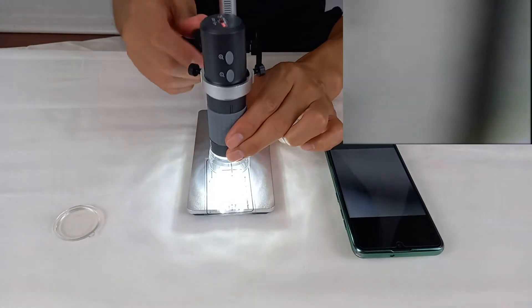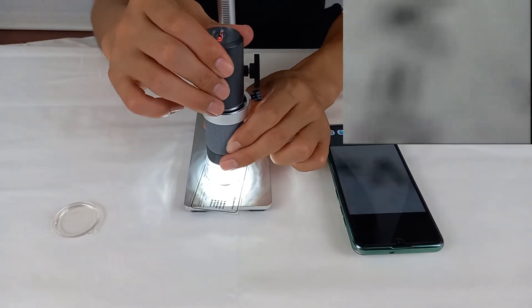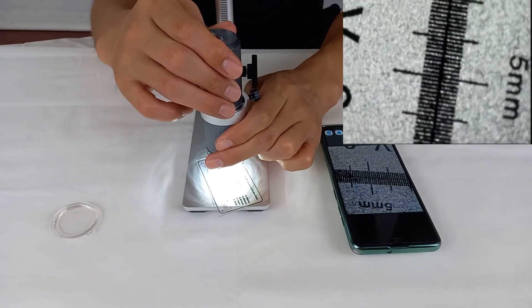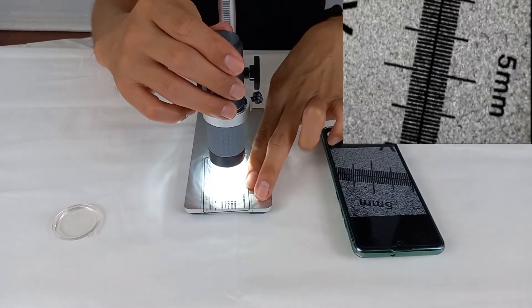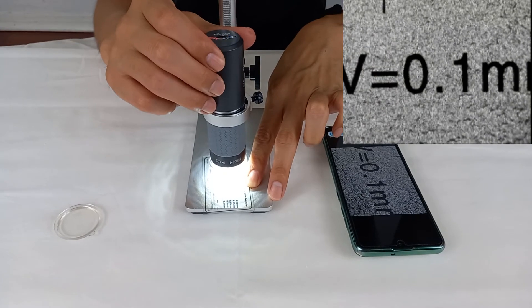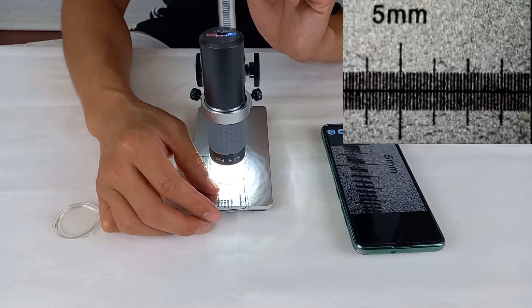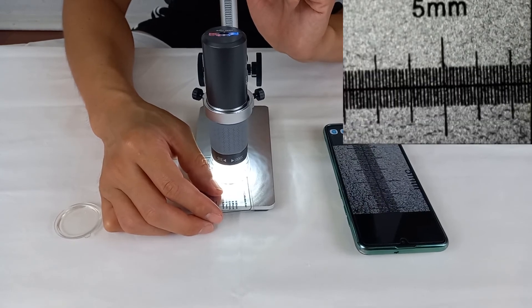Now I can see it! When I look at the ruler that came with the microscope, I saw something amazing. On my naked eye, it was just a single black line, but there were very thin lines in it. One big line indicates one millimeter, and the small line indicates 0.1 millimeter.